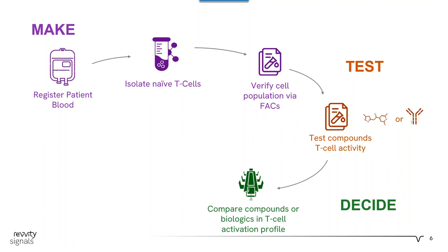However, due to time constraints today, we won't have time to go into this in great detail, but I just wanted to put it here because this is a critical step when we think about candidate screening, or when we're talking about just screening data sets in general, making sure that our screening is going the way we expect it. But this is the general flow, and I'm simplifying things here. This is generally a lot more complicated than this, and we work with various different companies to do so. But I just wanted to give an overview so you knew where we were starting and where we're ending today.